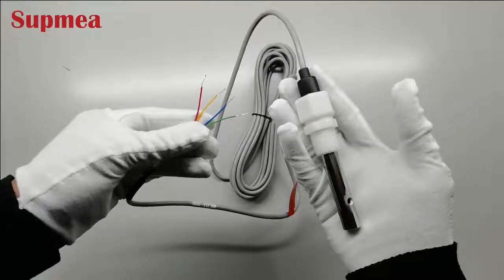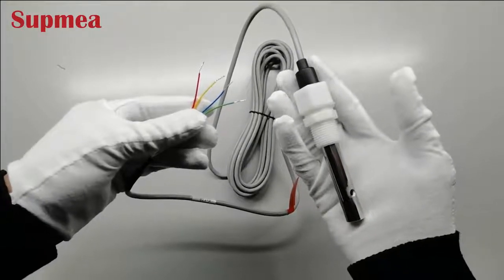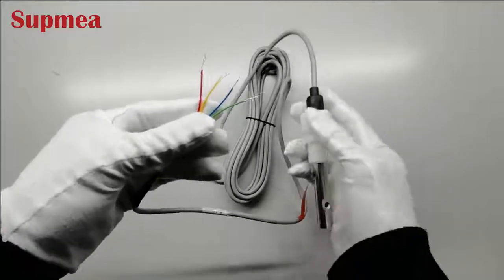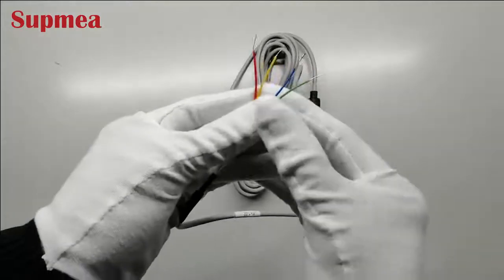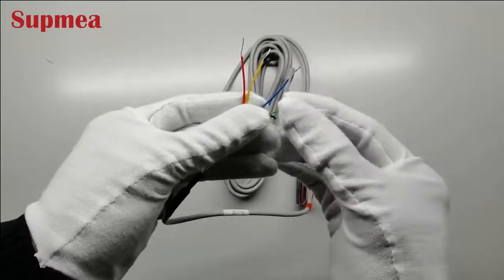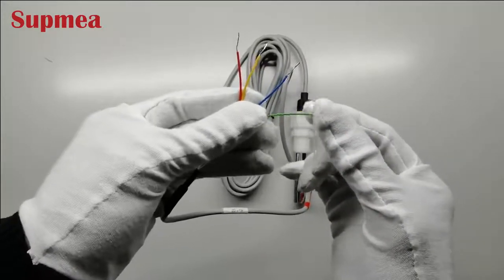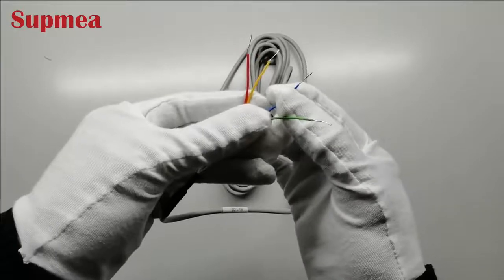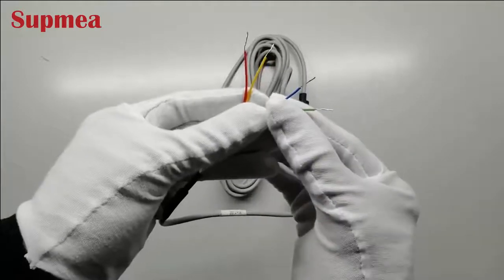This is our conductivity sensor. Our conductivity sensor has four wires in different colors. First, it indicates the measuring wire, the reference wire, the yellow and the red is for temperature.